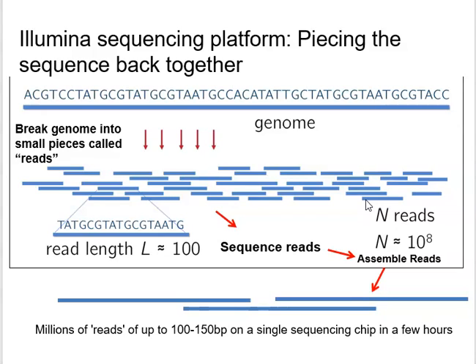It is really computer based. There's no way that we could do this any other way than just letting a computer take all those reads and piece it together as best that it can. All that happens then is that the full-length whole genome sequence is compared against the reference genome for humans and we look for anything that is different, and that gives us our somatic mutations in the cancer cells.